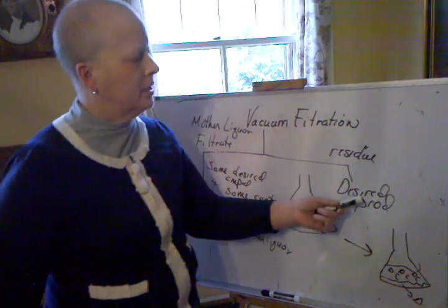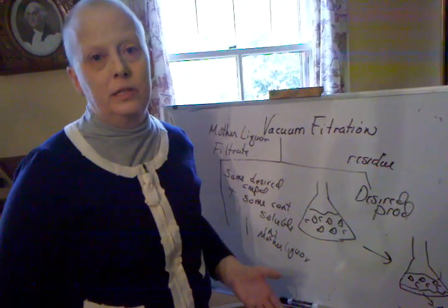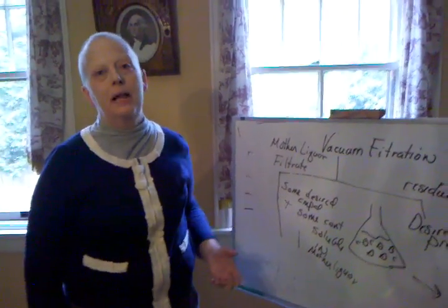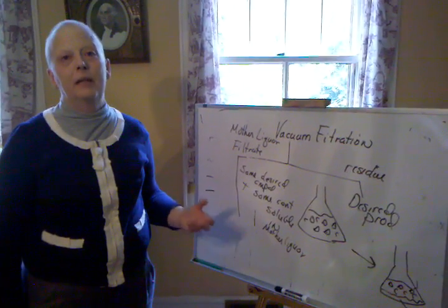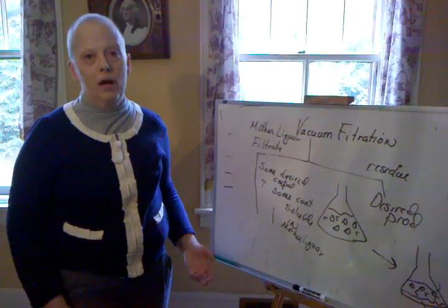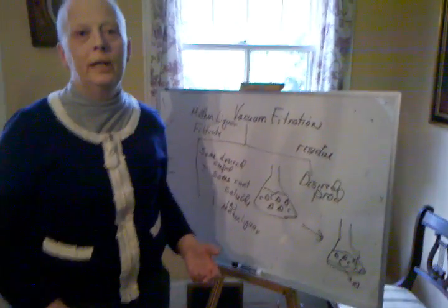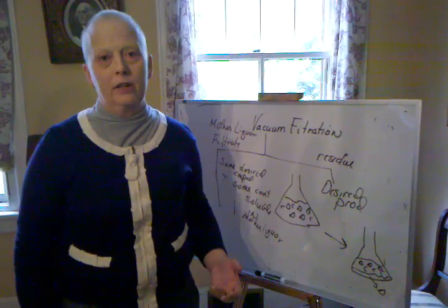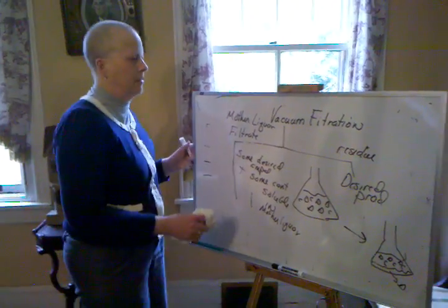Now, once you get this material, you could run spectra of it, you could melt it. These compounds we're going to do melting points of. Remember, if a compound is contaminated, and someday I'll get into this theory a little bit, but if an organic compound is contaminated with another organic compound, the melting point tends to be depressed and broadened, okay? If the compound is pure, you tend to get a nice sharp melting point, and that's a colligative property you learned about in general chemistry called melting point depression, okay? So we can tell things are pure by how sharp the melting points are. That's very helpful.